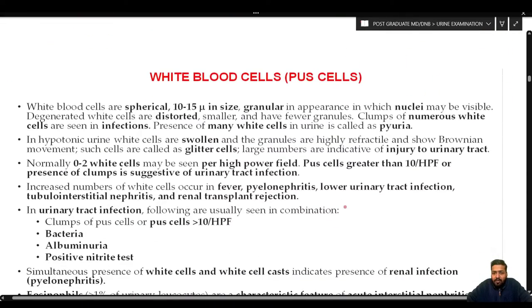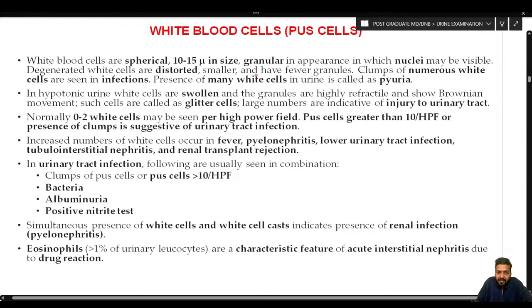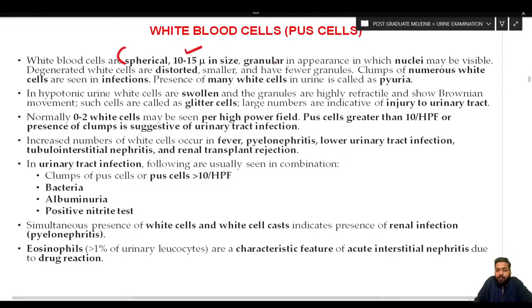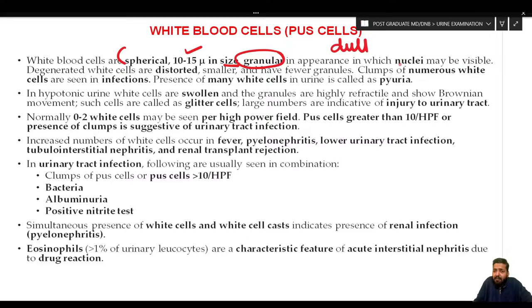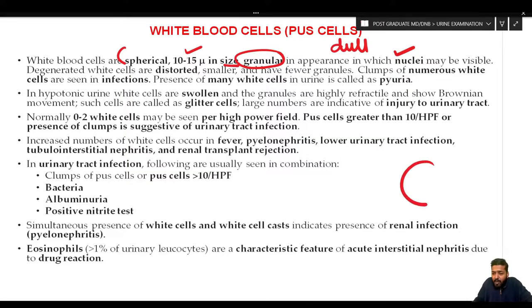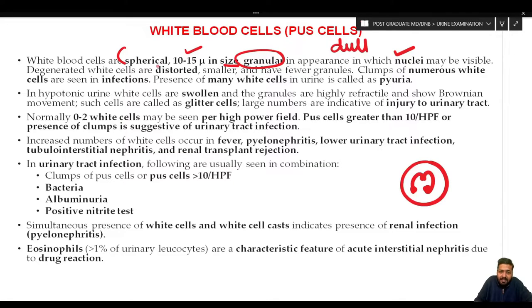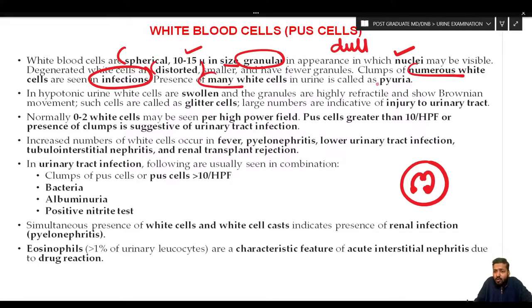White blood cells are spherical, 10 to 15 micrometers in size, granular in appearance, and have a very dull-looking appearance — they are not refractile, unlike RBCs. The nuclei may be visible; for example, you may be able to discern the lobes of a neutrophil. Degenerated white cells are distorted, smaller, and have fewer granules. Clumps of numerous white cells are seen in infections.